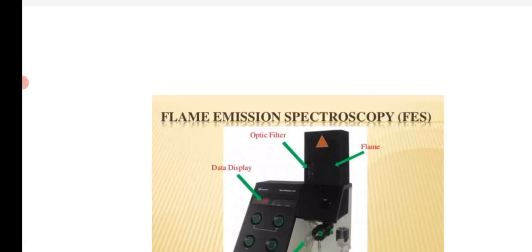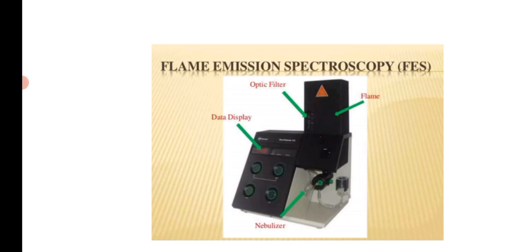Yes. The next one shows this set of apparatus with the same structure, flame emission spectroscopy. Already you know the nebulizer and the data display, which is the final reading out, and also one type of filter for the conversion of polychromatic to monochromatic light. This type of instrument needs a flame.